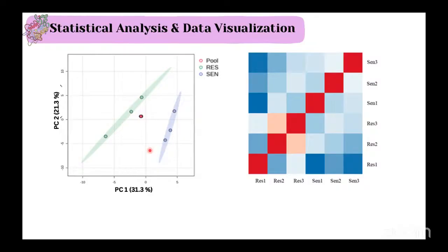Features are mentioned, and based on the eigenvalues of these features, your best classifiers are identified. I just submit my samples in the principal component analysis plot, and based on the eigenvalues, the best classifiers are selected, and then your samples are segregated, showing whether it is coming good or not.